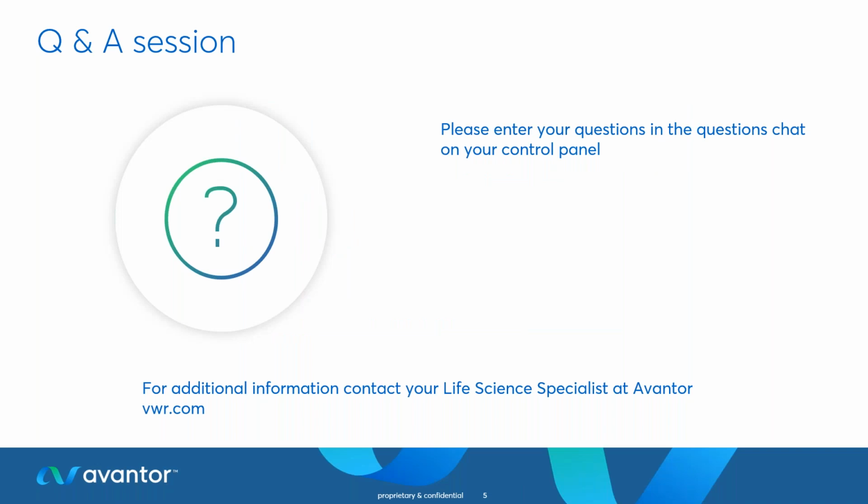We do have just a couple of questions so far. Is it possible to directly detect methylation in metagenomic assemblies? The short answer is yes. As long as you avoid PCR, you will maintain methylation information. Our ligation and native barcoding kits are PCR-free, and a methylated base will produce a different raw signal from a canonical base, so we're able to capture that information in the FAST5 files.